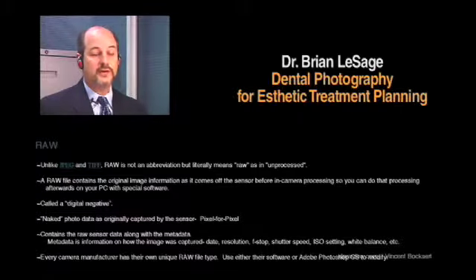So if you're really going to use these images, many of the cameras won't shoot TIFF. Right? So if you really want to do some publishing, okay, or if you really want to do some presentation, I would strongly recommend shooting RAW. They are large file sizes though, and again, you want to save those images as RAW. Then you need to go into, and they're very ugly. Let me also share that with you.